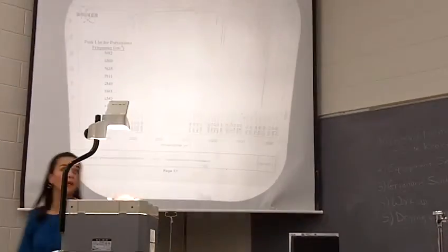So the IR that's posted on Moodle is this guy, as well as what's posted in the labs. You do not need to make a copy of this because everybody would have the same copy, okay? So let's save some trees, not make a copy of it. What you do need is this peak list. In addition to what the IR spectrum looks like, you want to compare these peaks to the peaks in your own IR spectrum, okay? So look at that on Moodle.